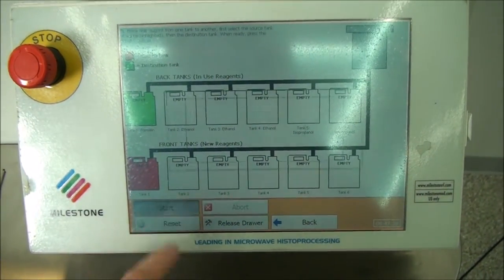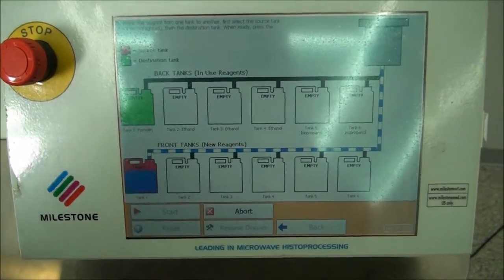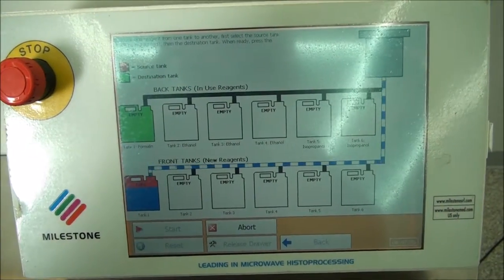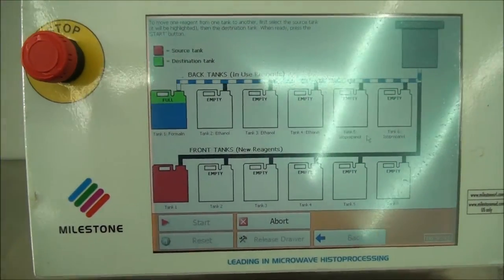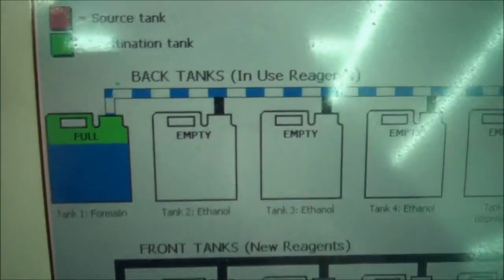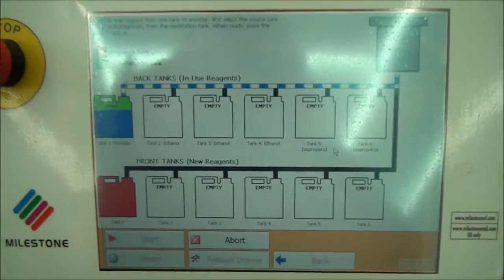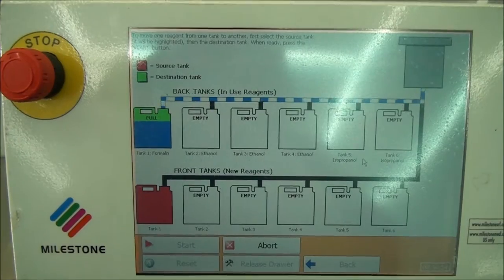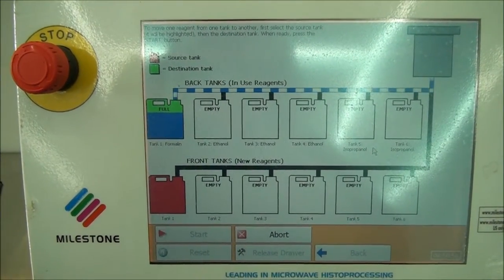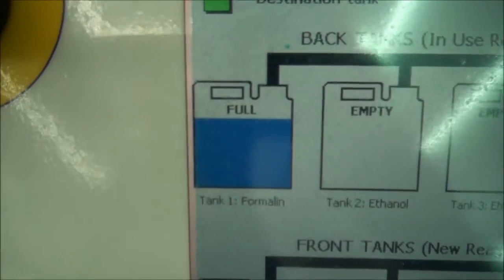There are multiple options for reagent transfers with the Milestone Pathos. Today I will show only the manual transfer of a reagent between Front Tank 1 and Back Tank 1. After selecting your tanks and starting the process, the reagent is transferred from the origin tank to the cavity, and then from the cavity to the destination tank. There is also an automatic reagent transfer option available, which uses this same process to ensure that the back tanks remain filled with reagent from the front tanks.